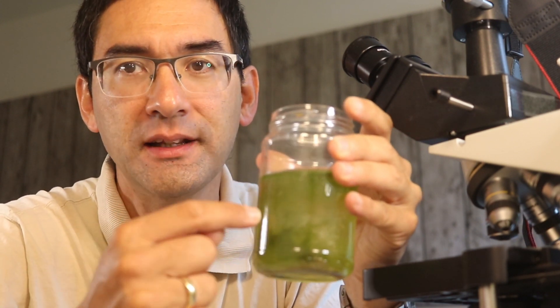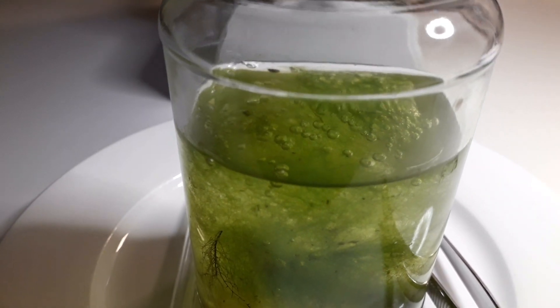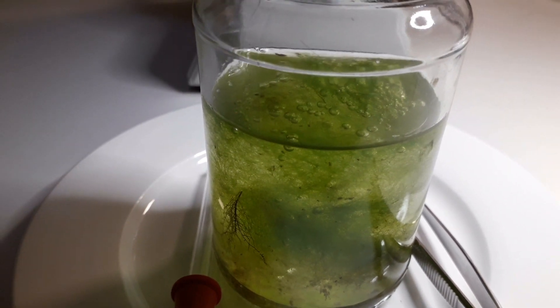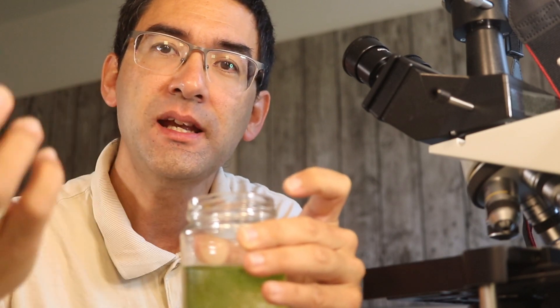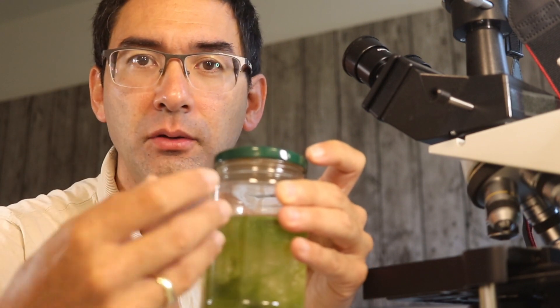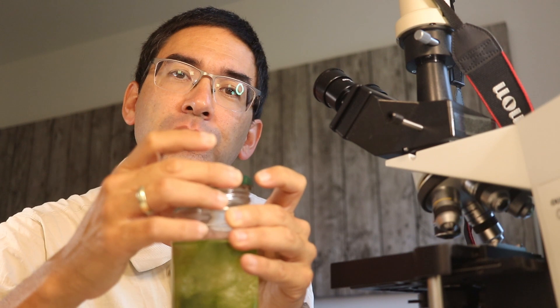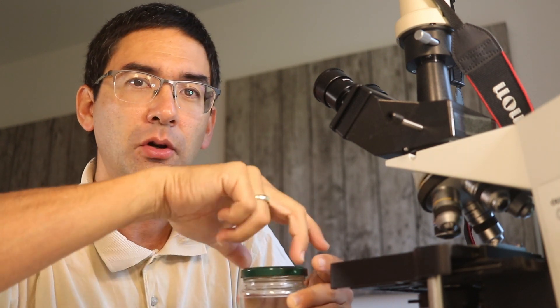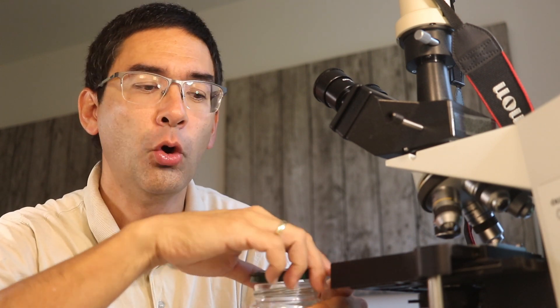The second way to increase oxygen concentration is to make sure there's some green stuff — green water plants or algae — in there, because they do photosynthesis and create oxygen. You can actually see oxygen bubbles in here as well. With plants or algae present, it's also okay to put a lid on top to minimize evaporation, but don't tighten it completely. Open it every day to allow some exchange of air, since carbon dioxide for photosynthesis is also necessary.